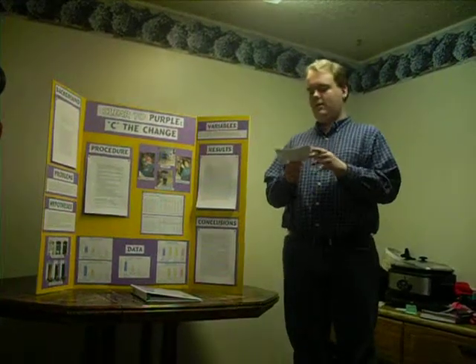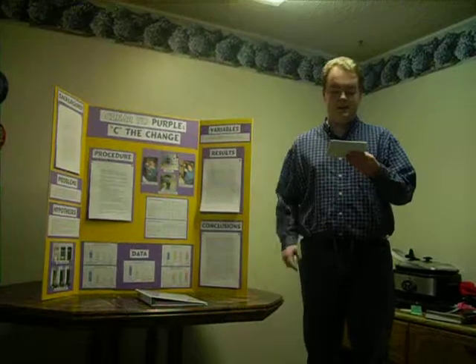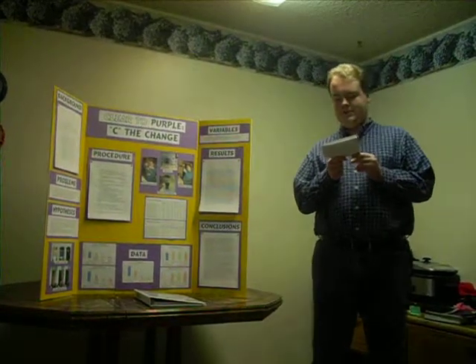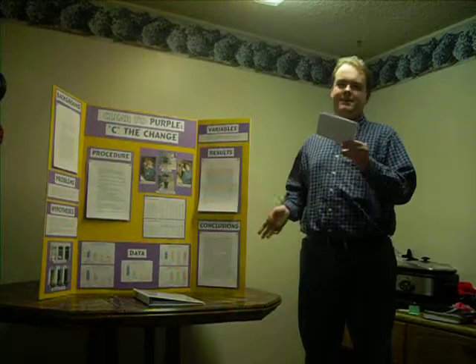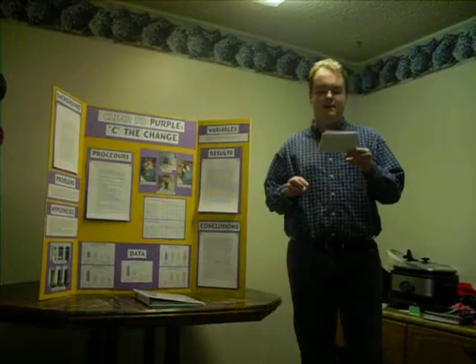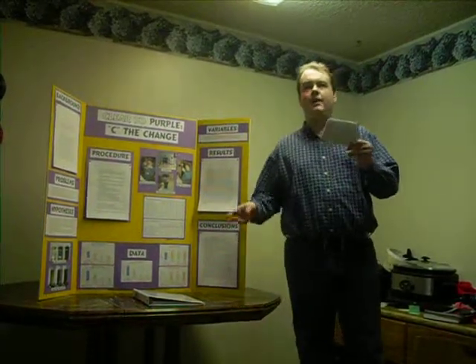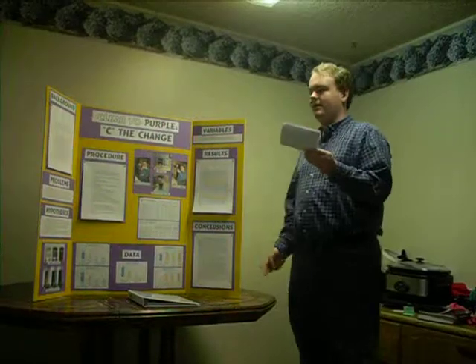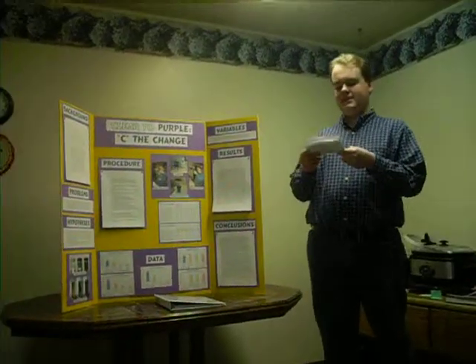The second problem, which is the one that dealt with the Briggs-Rauscher oscillating reaction, is this: what are the effects of varying temperatures and varying amounts of hydrogen peroxide, which in this case is the key sustaining reactant, on the Briggs-Rauscher oscillating reaction's speed of oscillation? Note that I'm not testing the length of the Briggs-Rauscher oscillating reaction, just how fast the sub-reactions go in a certain period of time. My hypotheses for these experiments were these.